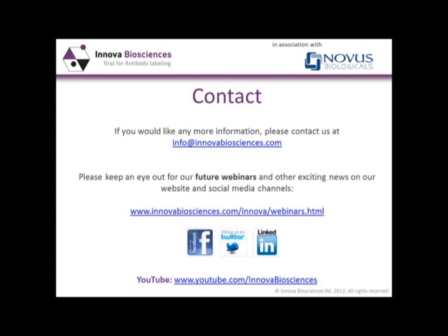That's great. Thanks, Graham. There was one other question here from Tom about the benefits of direct antibody labeling versus secondary antibody labeling. And this is quite an interesting area. Over many years there's been a perceived wisdom that using a secondary antibody labeling system, either in flow cytometry or in other techniques such as Western blotting, will lead to increased sensitivity because you're using two layers of antibodies. We've got quite a lot of data that shows that using direct conjugates can be just as sensitive because you're not having to worry about non-specific binding with your secondary antibodies or cross-reactions of your secondary antibodies with the cell surface or any of the other antigens that you're using.